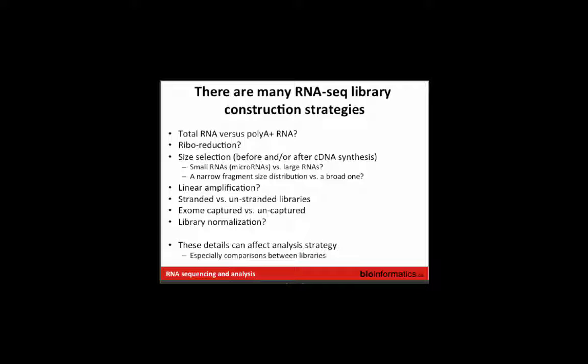So you're removing the ribosomal RNAs because they just take up too much of the sequence. They're 95 to 98% in human. But otherwise, you want to have this idea of sequencing the whole transcriptome, whatever is there, and analyzing it after the fact rather than imposing this upfront limitation that the RNAs have to be polyadenylated. But there's a cost trade-off in there: you're taking a wider view of the transcriptome, so it takes more data to cover that wide view well.